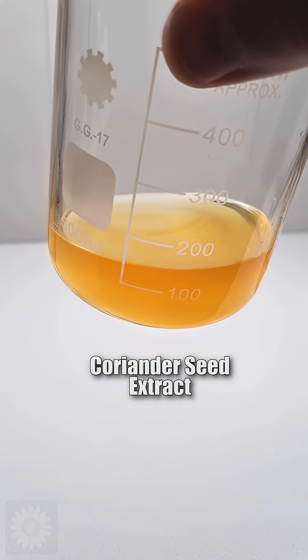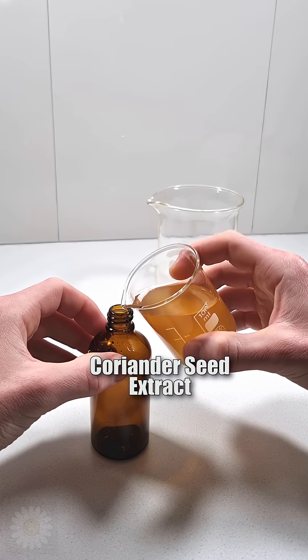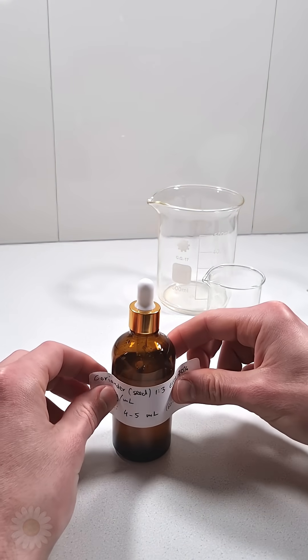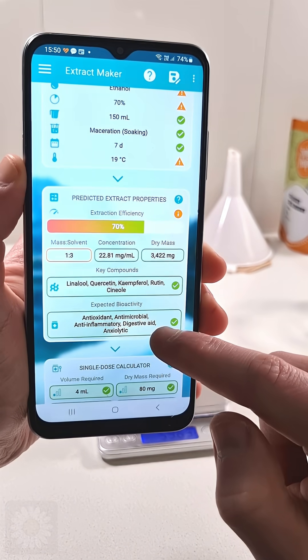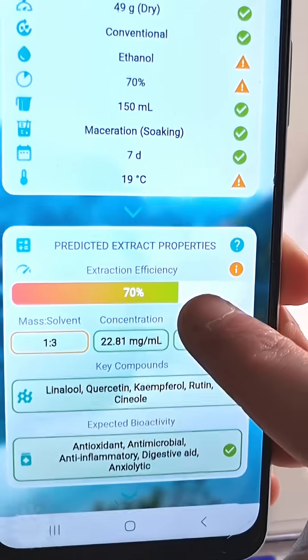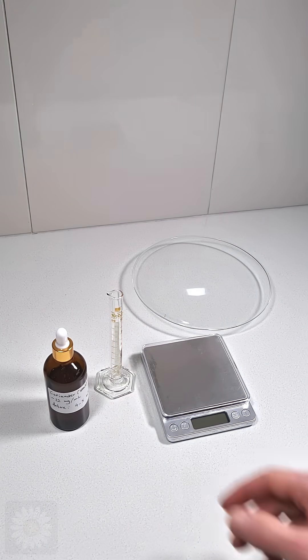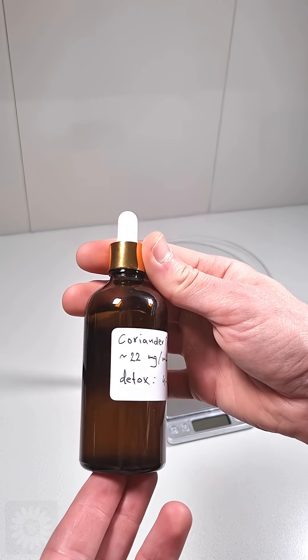In our last video, linked below, we used the Extract Maker app to create an alcoholic coriander seed extract. The app calculated 23 milligrams of coriander per 1 milliliter of tincture, but we didn't check if that was accurate. In this demo, we show you how to test the strength of any alcoholic extract you create.